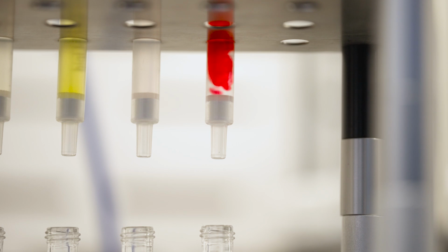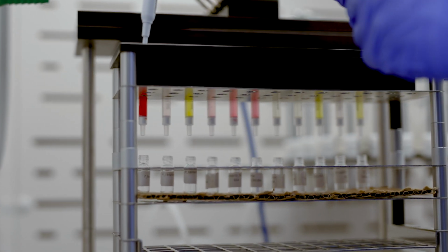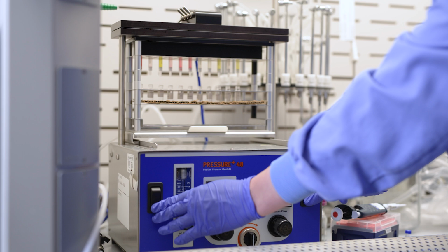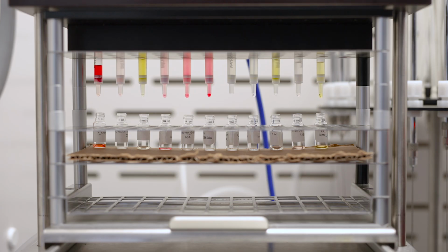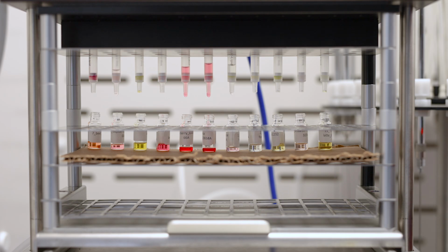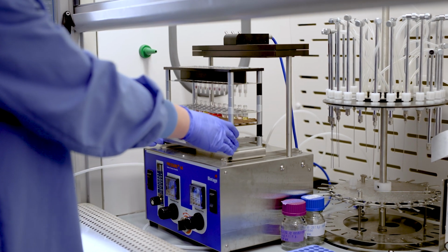During the extraction process, a custom internal standard mixture comprised of small molecules not naturally present in food is added to each sample. A small amount of freeze-dried food is first dissolved into an aqueous solution, which is then passed through a solid phase extraction column. This process will bind and remove interfering molecules while letting the small molecules of interest pass through.